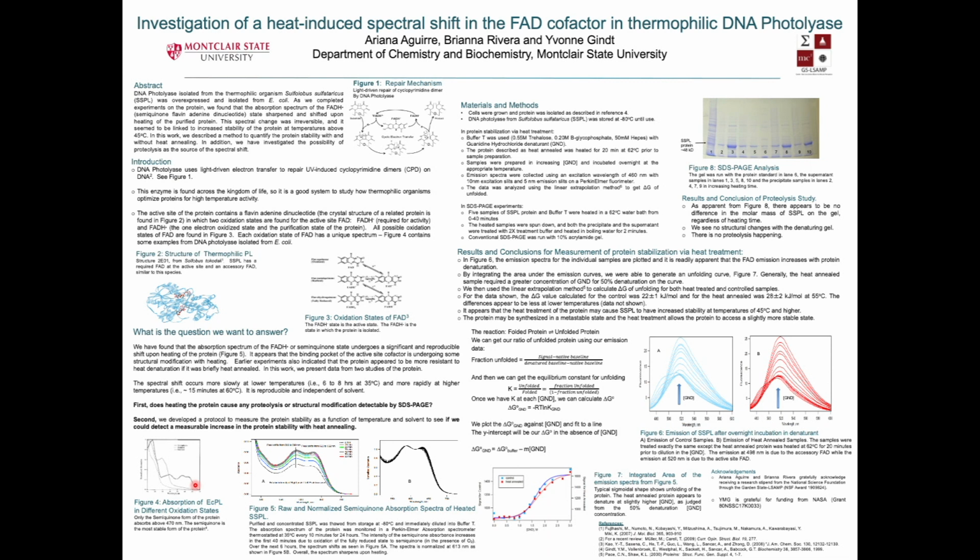One of the reasons I was examining was if heating the protein caused proteolysis of the protein. Proteolysis means that the protein was possibly cleaved into smaller pieces. So, we ran SDS page to monitor the size of the protein. What I have shown here in Figure 8 are 9 different protein samples, and in lane number 6 is the standard. On the gel, smaller proteins run faster and get further down the gel, while larger proteins run slower.